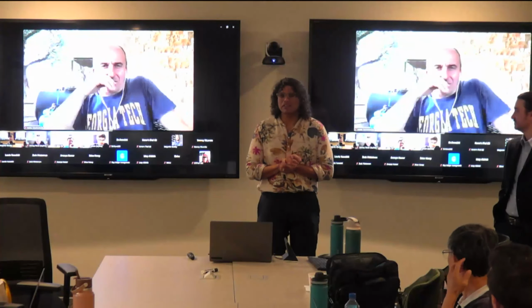probably doesn't mean a lot to a lot of people. Essentially, this is ideal for industrial type samples, so cells that are growing in a big process. It's not ideal for surface water samples. And so at the end, I'll talk about Farhan. He's really optimized the system for that type of sample.